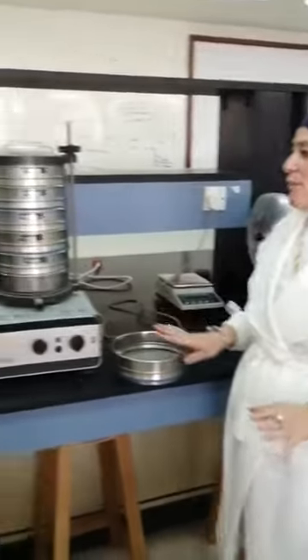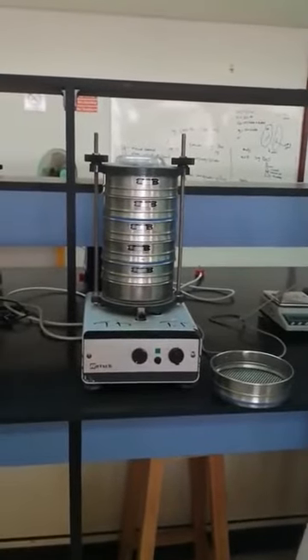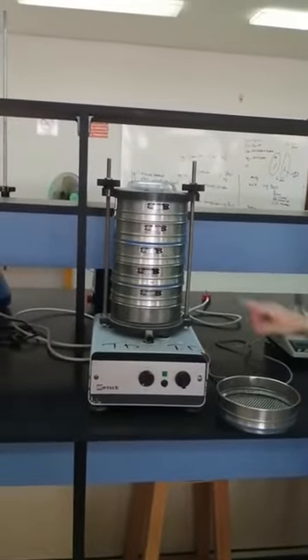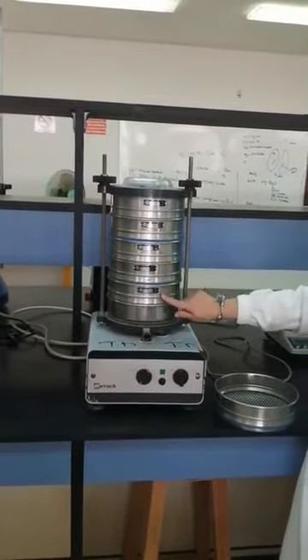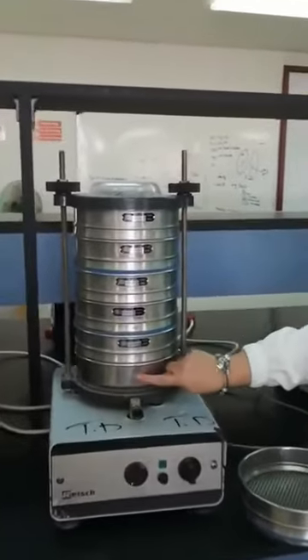The second step in the micromeritics lab is to measure the particle size distribution of our sample. We have a nest of sieves arranged from the coarse to the fine and ended by a tray.